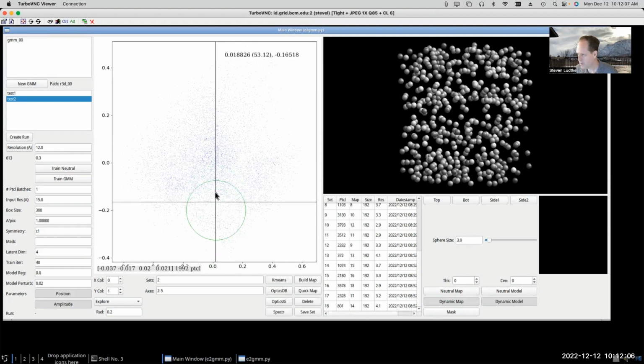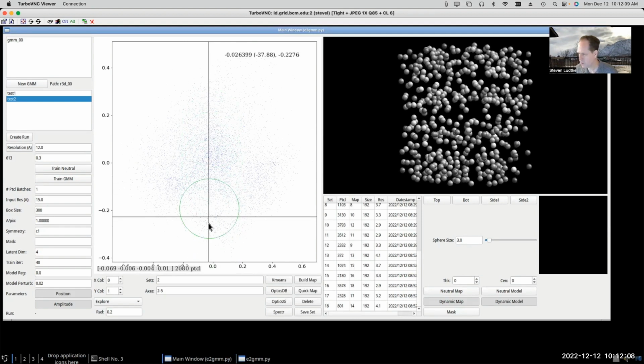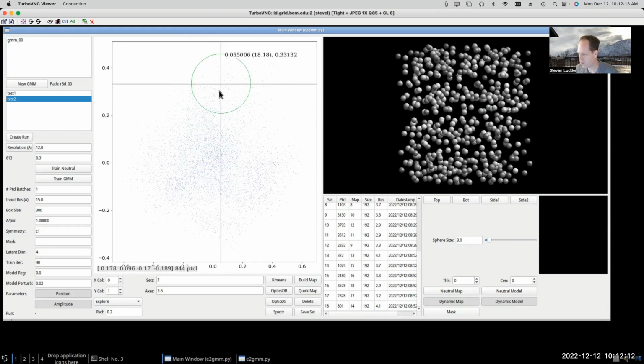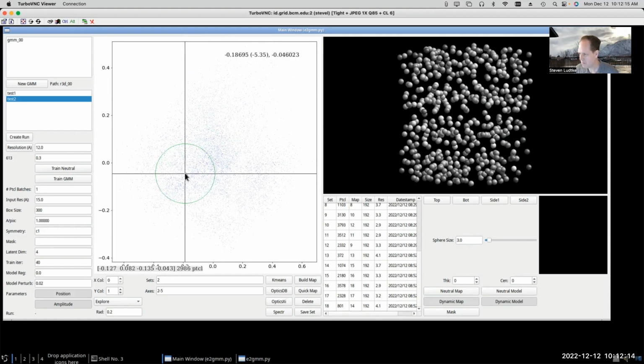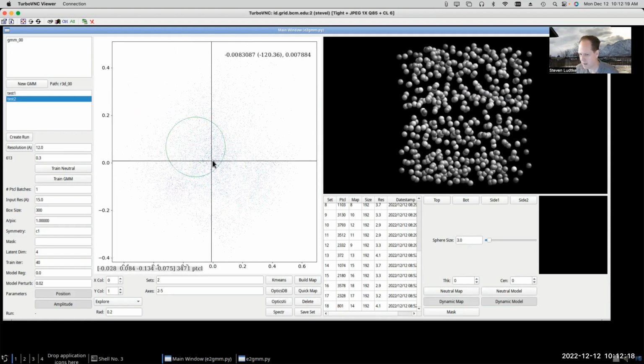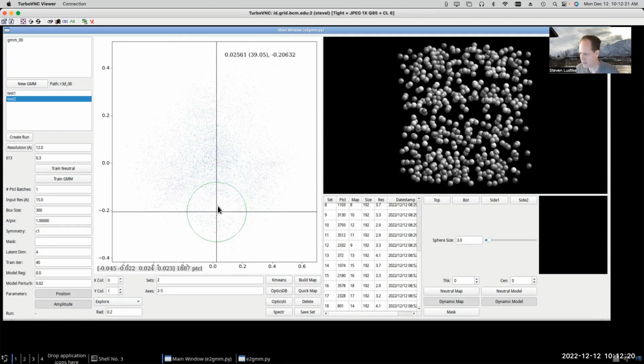So now as I move up and down, we can see that seems to correspond somewhat, at least, to motions of that domain. Now, maybe if I did an axial thing, that would be better, or maybe this way would be better. I don't know. It looks like this is not too bad.